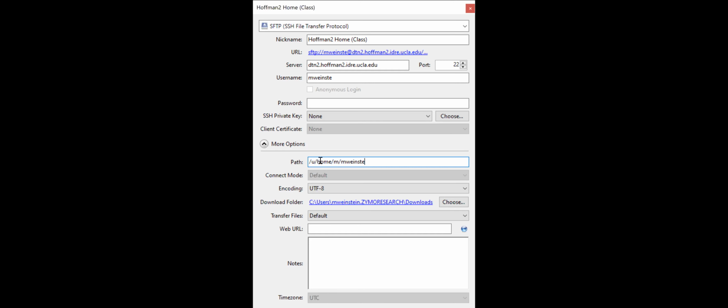So I'm going to leave this up here for a minute. And again, remember, don't copy this portion from mine because that's for my username. It's going to be the first letter of your username / your username.